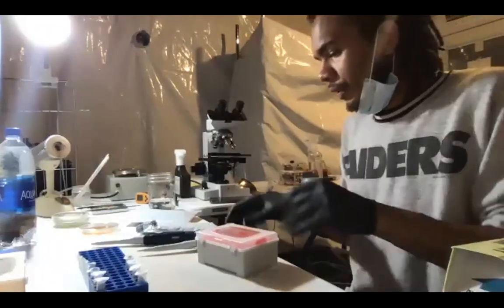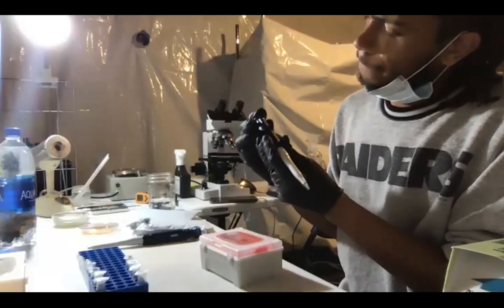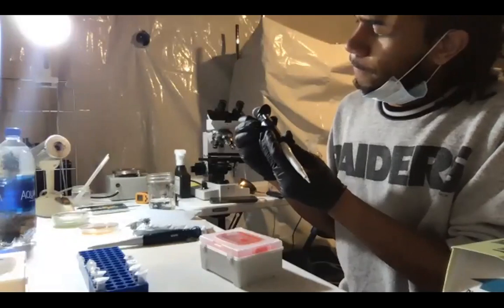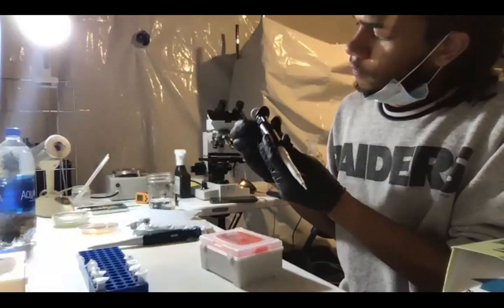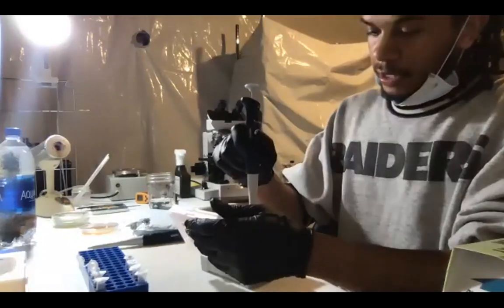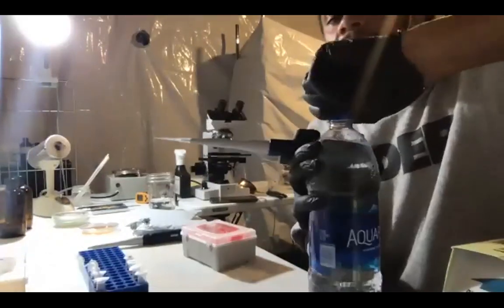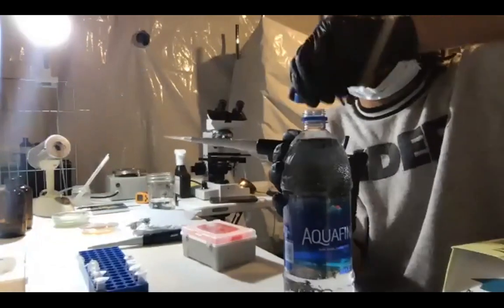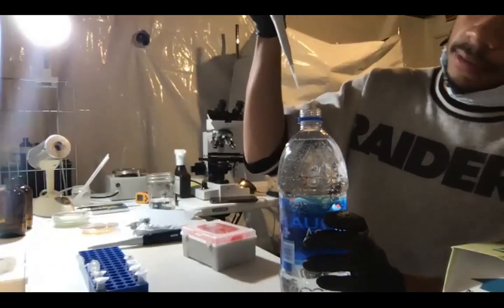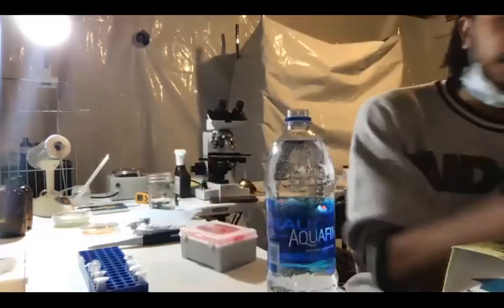The next thing I'm going to do is turn this all the way up to 10, and I'm going to take 10 microliters of my clean water and put it into each of these. You can do 9; I just choose to do 10. This stuff is really, really concentrated, and this is just to dilute them because they're too concentrated. New pipette tip for each one.